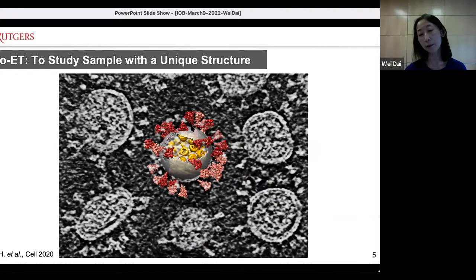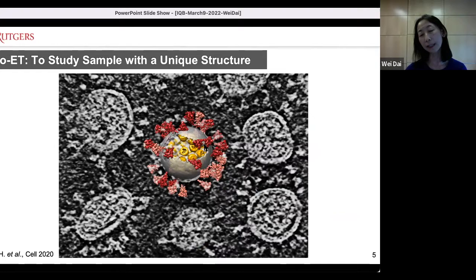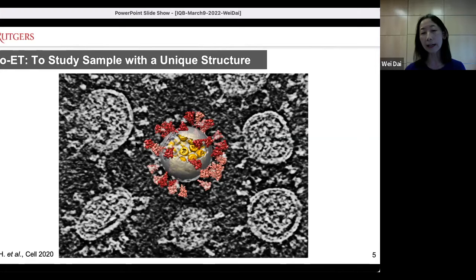Because tomography captures the actual structure, we can apply it to study unique structures. This is a 3D reconstruction of the SARS-CoV-2 viral particle on the background of a tomogram slice. From the 3D reconstruction, you can see the envelope is decorated with spike proteins, but it's not uniformly decorated — each individual particle has its unique set of spike proteins. The sizes, morphology, or even general packing in those particles may not be uniform. If you average all those particles applying single particle analysis, all that information will be lost.